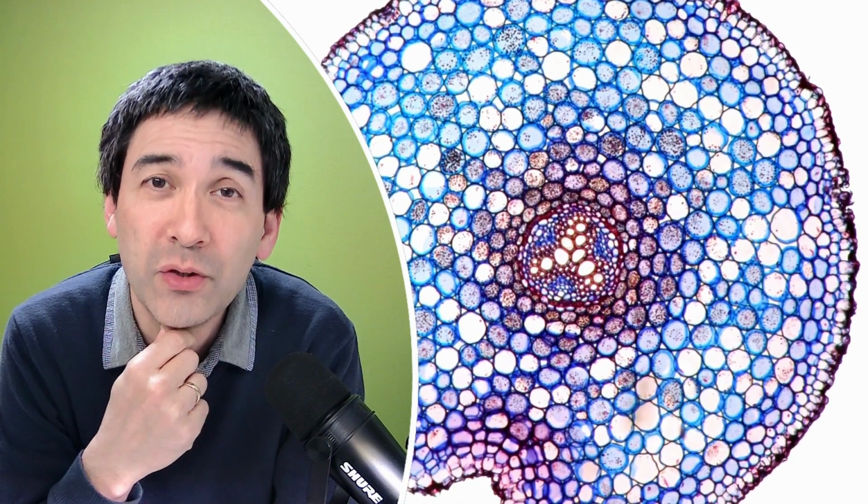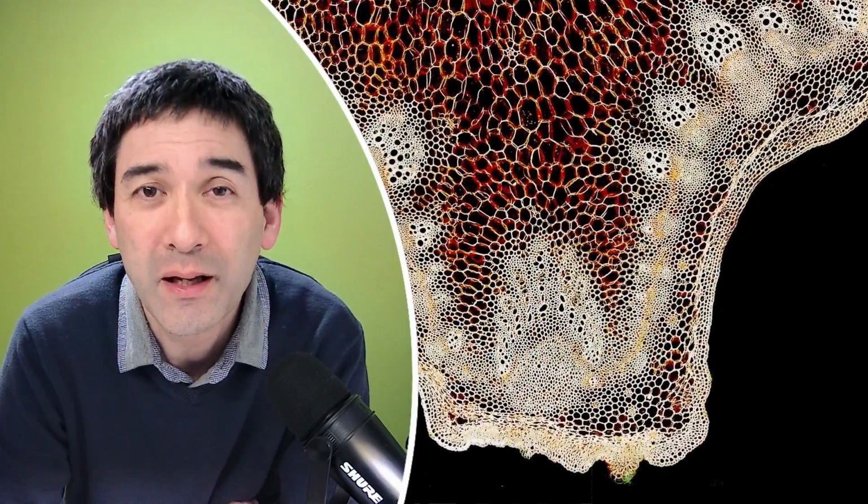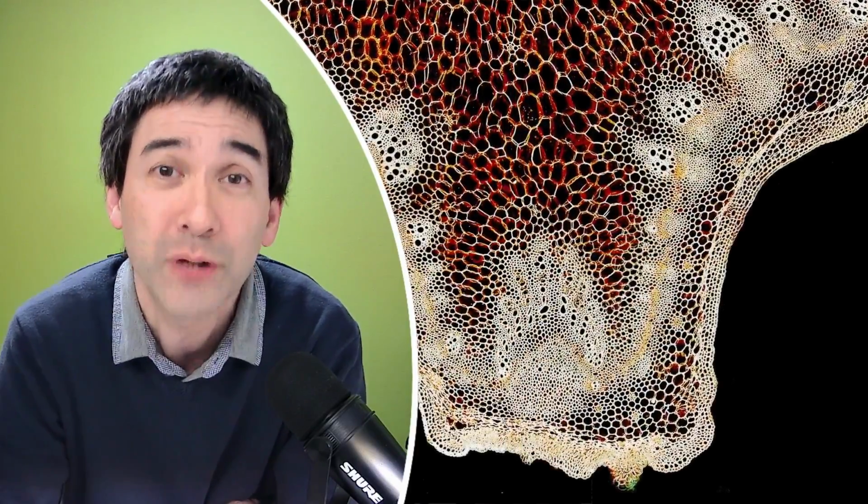And every time when you are in a microbiology lab, you have to make sure that any microorganisms that have come in contact with your equipment, petri dishes and whatnot, are killed before you actually throw out all of the equipment. So even if you're using disposable plastic petri dishes and equipment, it's important that you sterilize everything before throwing it out, because you do not want to spread microorganisms around, which might become harmful when inhaled and so on. And you do that by essentially putting the equipment into a pressure cooker.